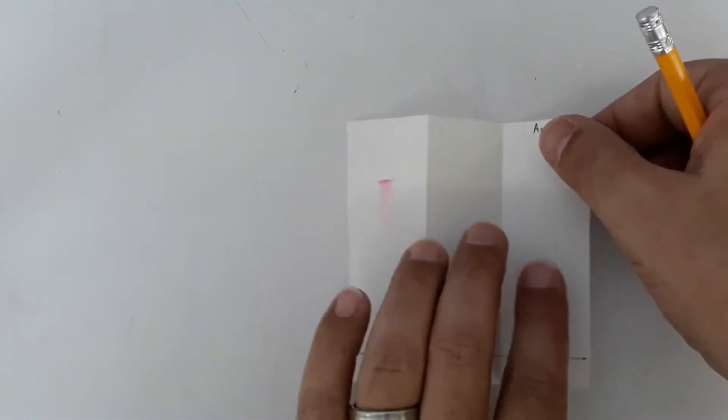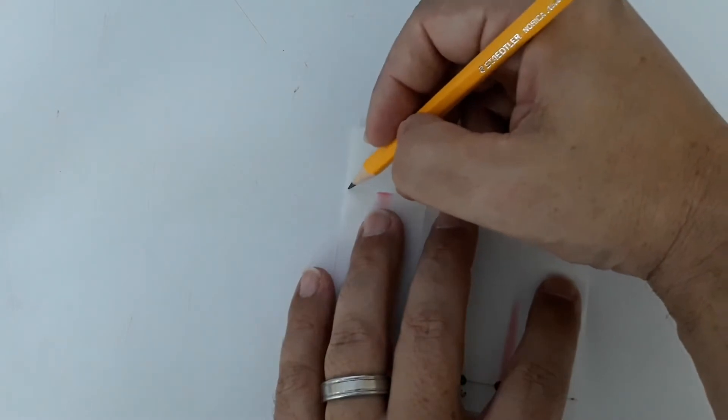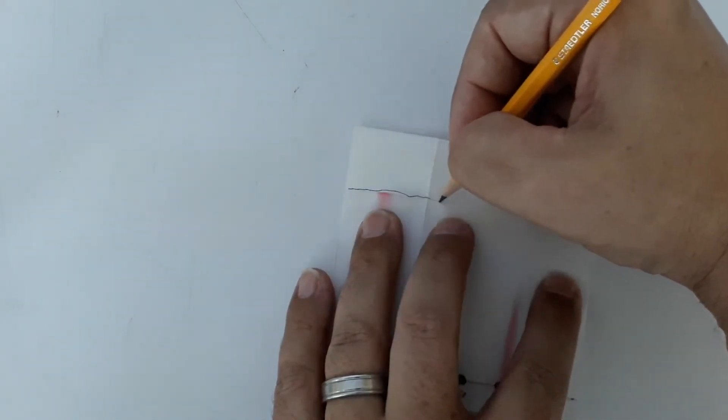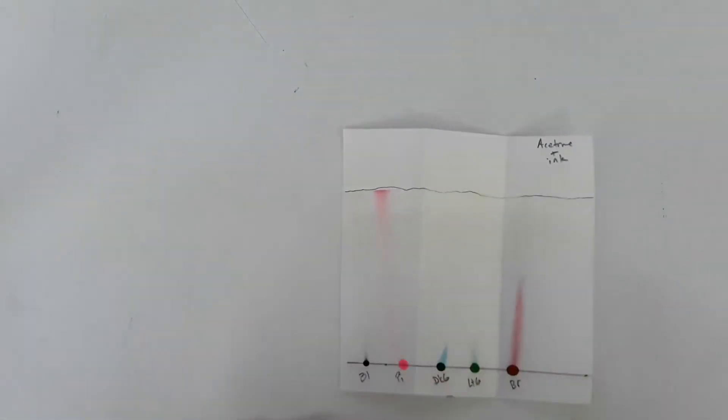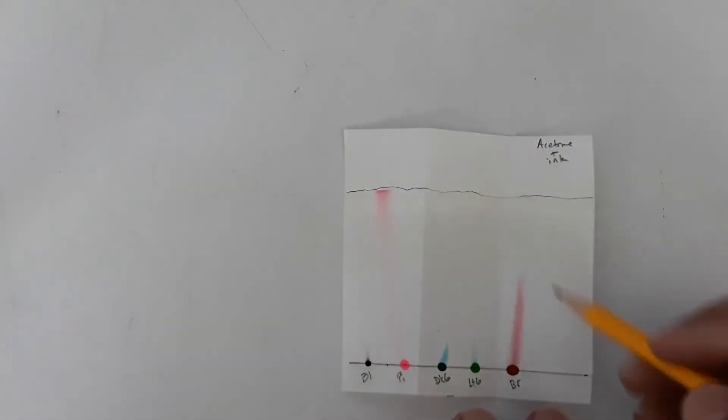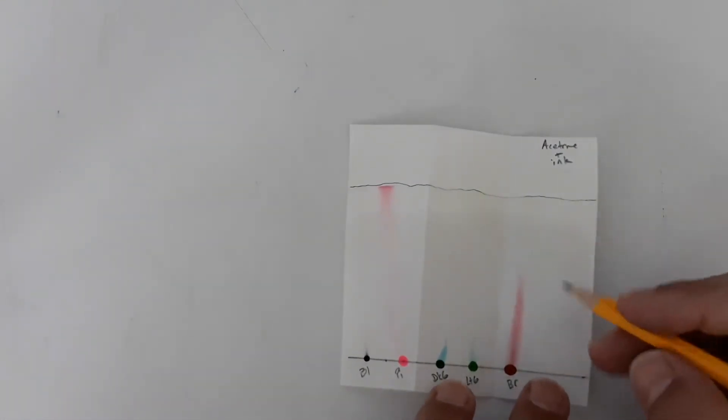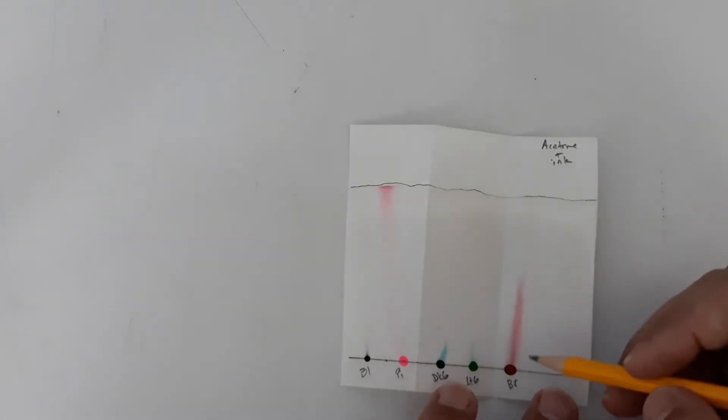Okay, here is the acetone chromatograph. I'm going to trace the edge of the solvent front because the acetone is going to evaporate really quick and that solvent front is going to recede. You can see it's coming back down the paper already and then I'm going to trace out the colors that I see.